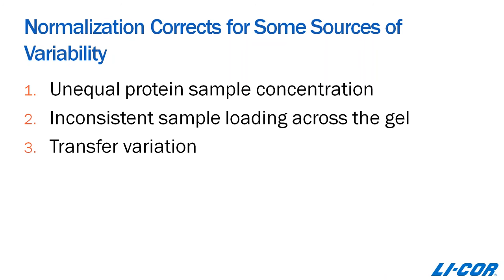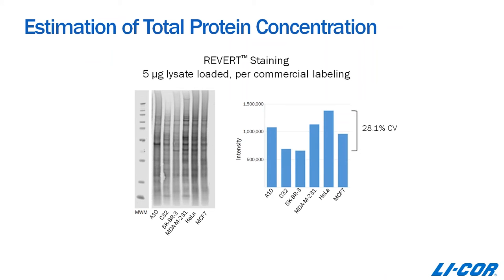When it comes to estimation of total protein concentration, that's something that can't be emphasized enough. It's really not safe to assume that your lysates all have uniform protein concentration, even if you're using a commercially available lysate. We evaluated a number of different commercially available lysates, loading each lane with five micrograms based on the manufacturer's reported concentration, then transferred those proteins to a membrane and stained it with Revert total protein stain. The graph on the right depicts the wide variation between each of these commercially available lysates — the CV across these lysates was about 28%.